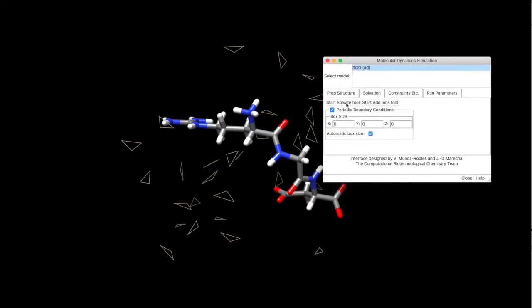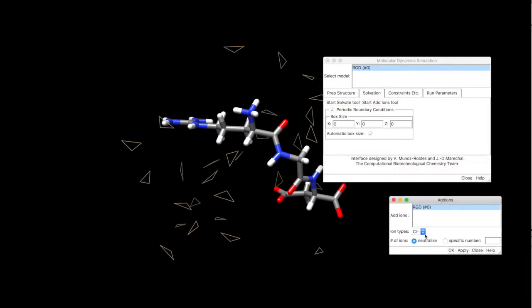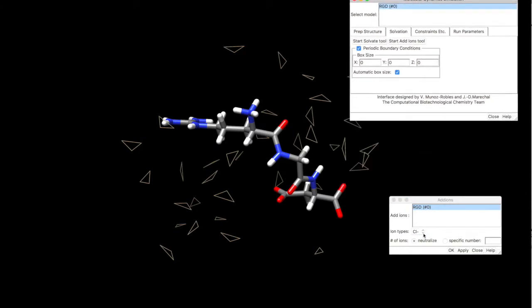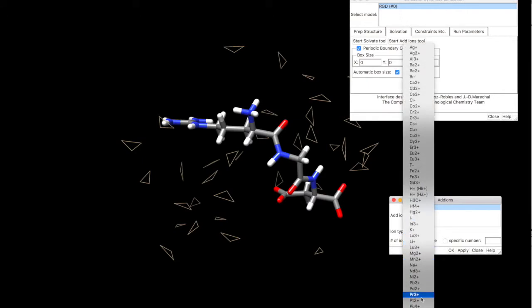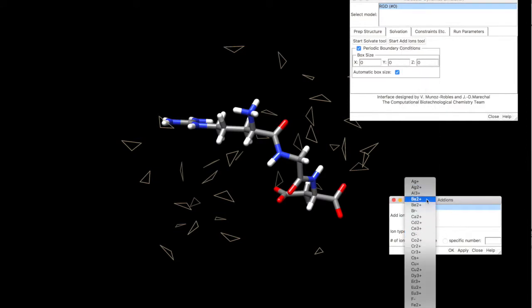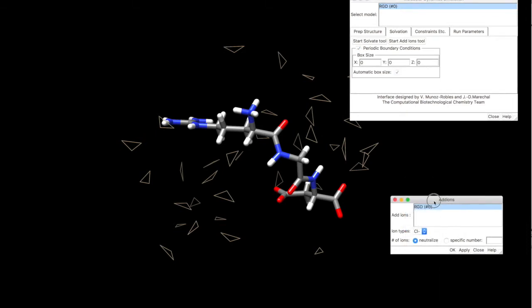Once we have that, we can add additional ions if needed. We can neutralize, or add specific atoms to the system. If you click ion types, chlorine, let's click apply, no chlorine is shown. Let's click for example, see the selection here, it's quite good. What else we have here, looks like our system is already neutralized, so we don't have to add anything. So click ok.